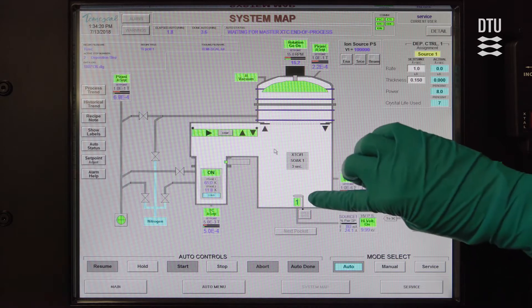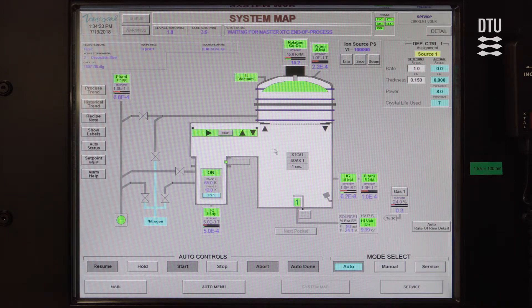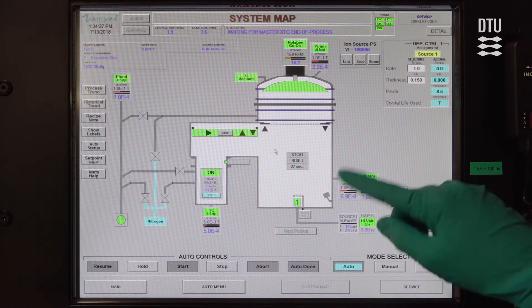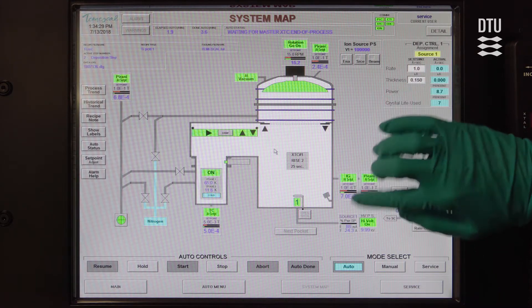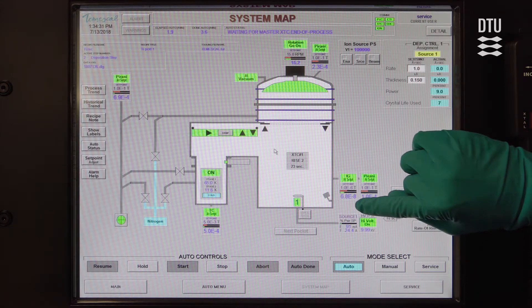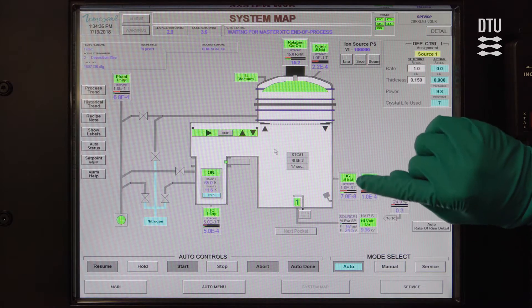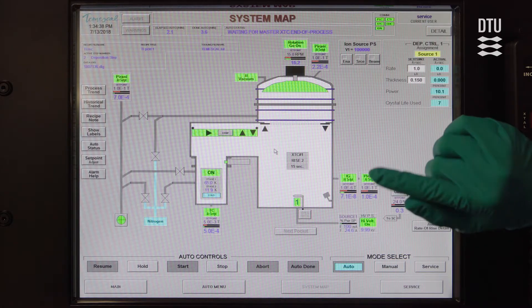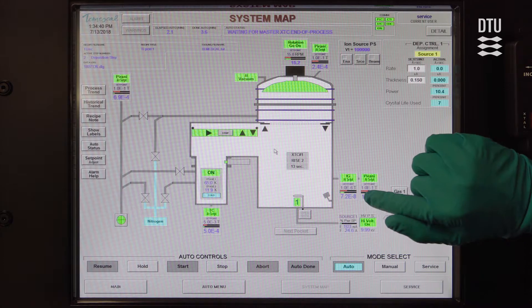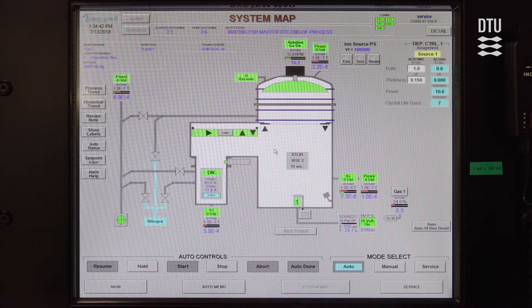You can see that right now the shutter is closed. And already during the rising and soaking, it's a good idea to have a look at what's happening to the pressure. You can see right now we have a wonderfully low pressure. And this is also related to the fact that we are depositing titanium because titanium generally makes the pressure fall. But some other materials do the opposite; the pressure will rise and you need to keep an eye that it doesn't rise too high.